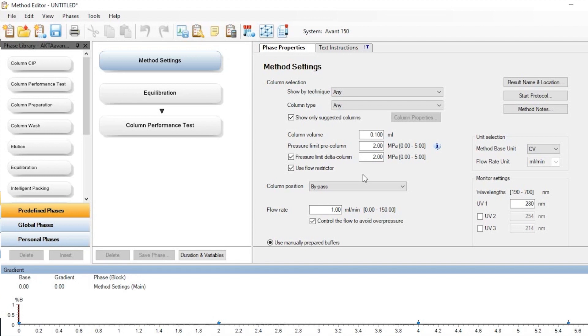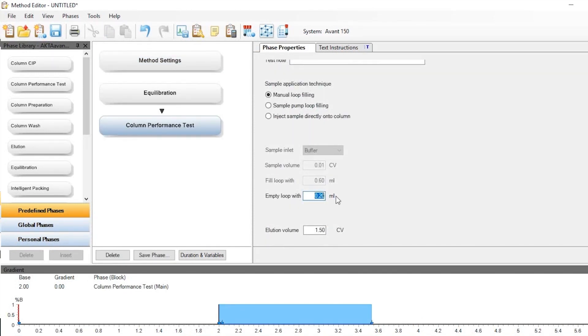Type in related parameters such as pre-column and delta pressure limit according to the column and resin type, inlet of buffer, flow rate, volume of equilibration, and volume of sample application. Here, Capto-Q Impress was packed in Tricorn 10 over 100 to a volume of 7 milliliters. The pressure limits were set accordingly and the sample volume was set to 0.07 milliliters.